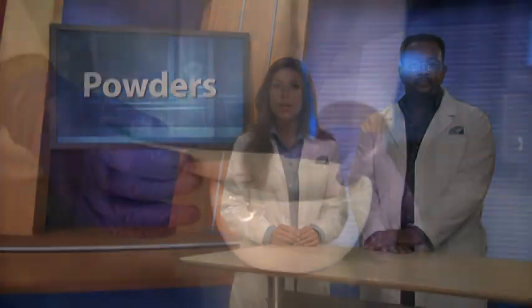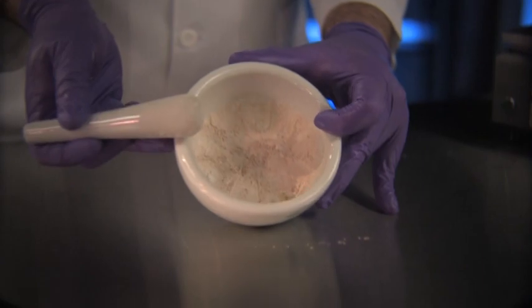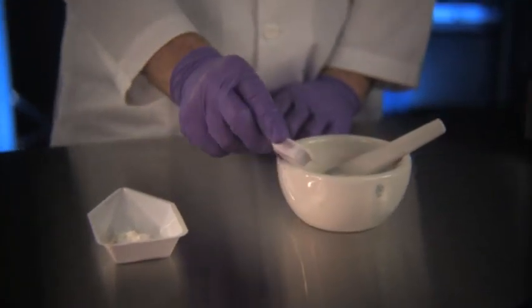Like creams and lotions, powders are used externally and are not often available commercially with the correct amounts of medication in one formulation. To prepare a compounded powder, the particles must be uniform in both size and density. This is accomplished by combining the powders together in a mortar and pestle. This is known as the geometric dilution method.